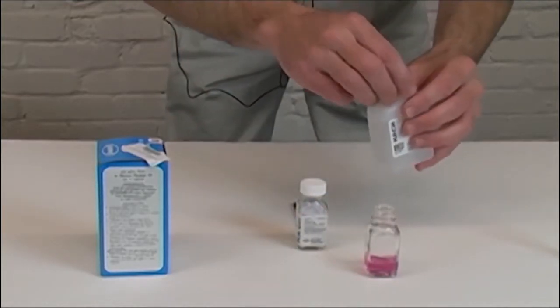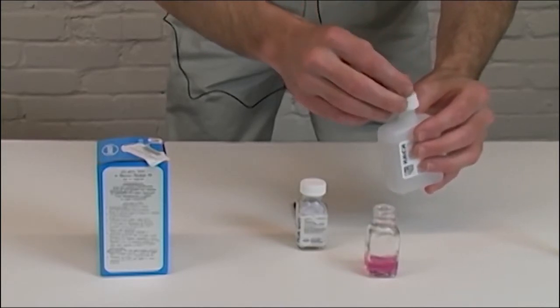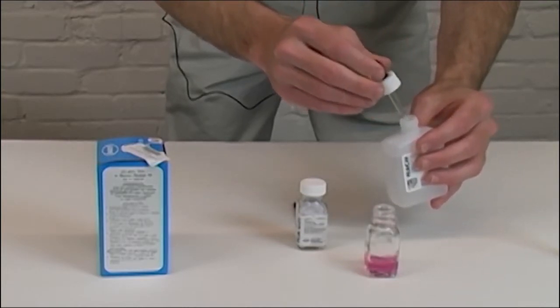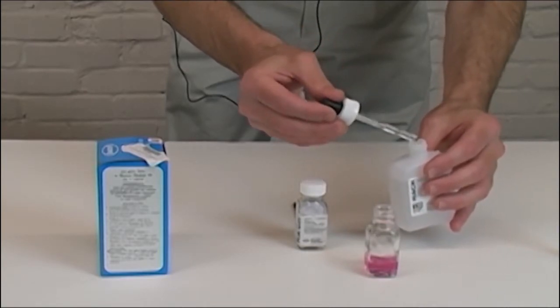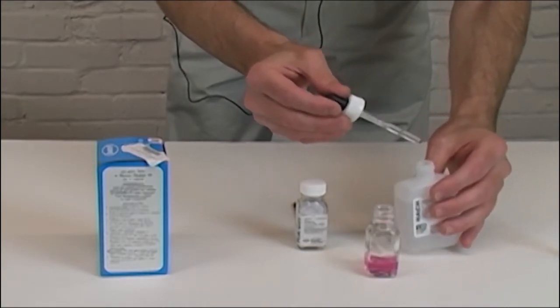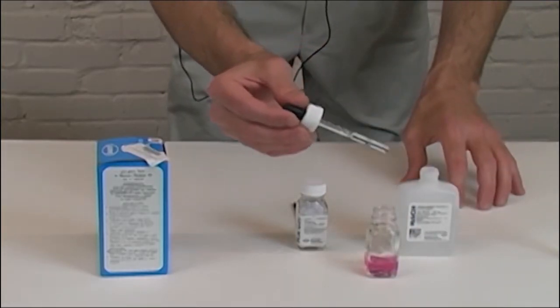Then you'll take your titrant solution and it's very important you count the number of drops that you're placing in here. For each drop it'll tell you a grain of hardness. So two drops would be two grains of hardness, one drop would be one grain.